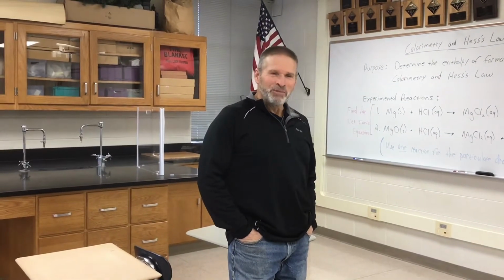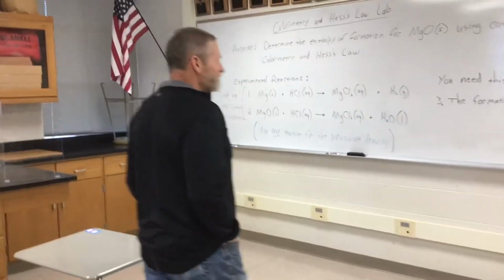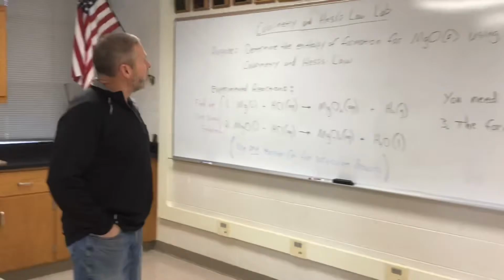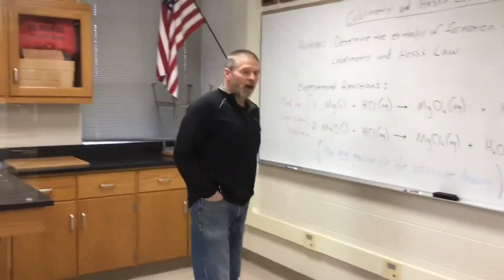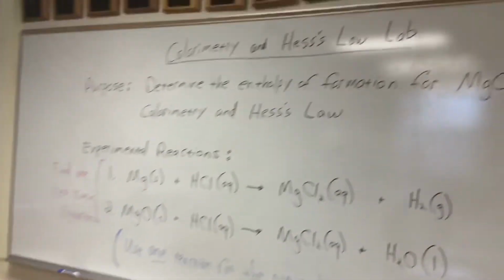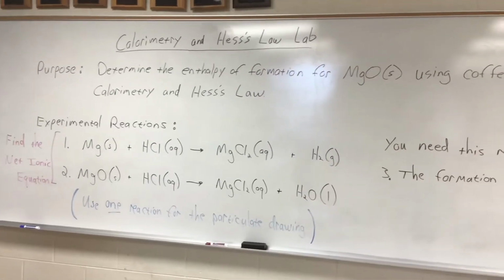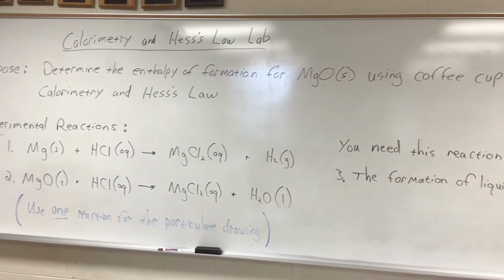Mr. Hevel, you have a calorimetry experiment for us today? We do, Mr. Moore. We have calorimetry galore here. Absolutely. So what we're doing here is coffee cup calorimetry and everybody's favorite, Hess's law. And here's what we're trying to accomplish. We're trying to determine the enthalpy of formation for solid magnesium oxide.